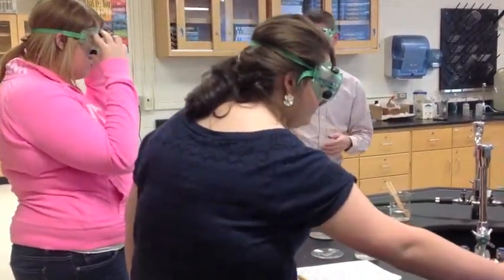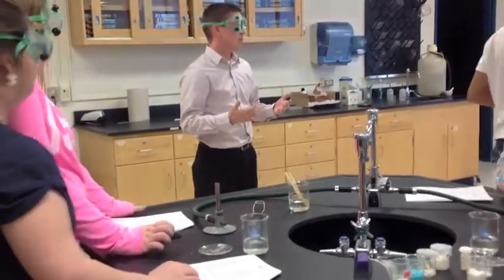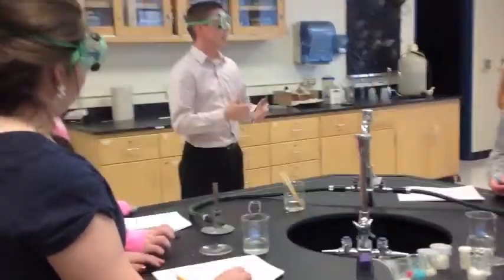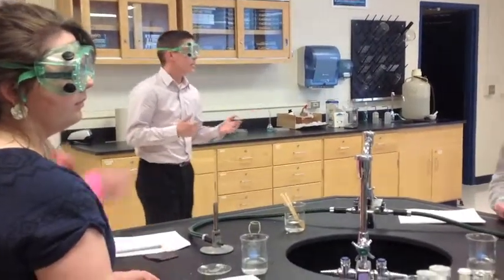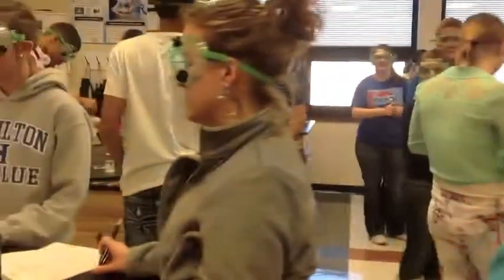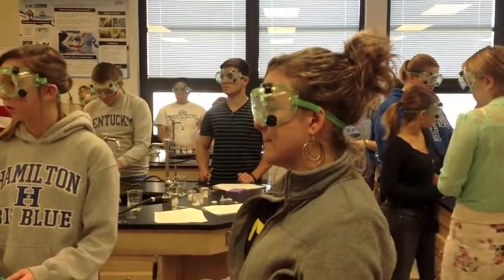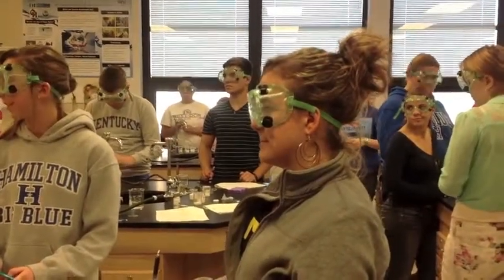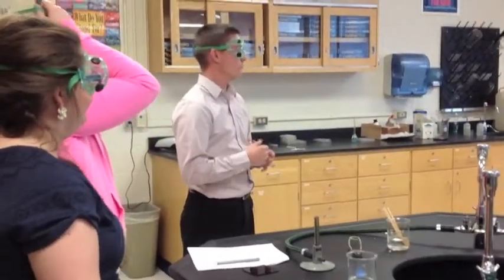So, listen. The main idea from this lab, instead of us just telling you what the emission light spectrum of these elements are, is to be able to determine this emission line spectrum based on the fact that they emit this light when they are put into a flame.